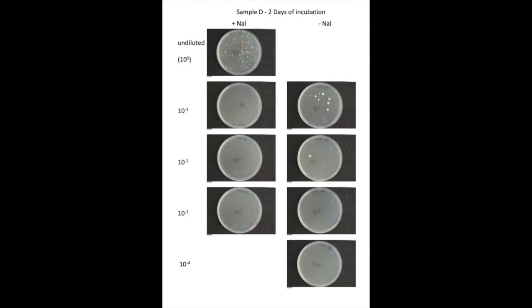The colonies growing at this stage, after only two days incubation at 30 degrees, are probably not Streptomyces, but are more likely faster growing bacterial species such as bacilli.